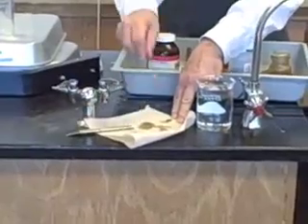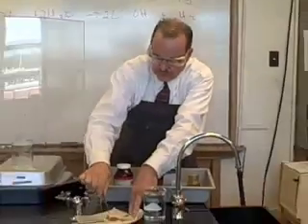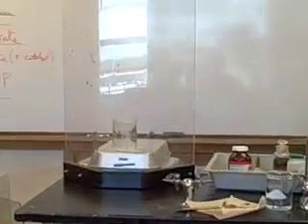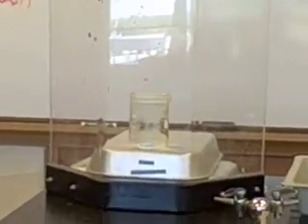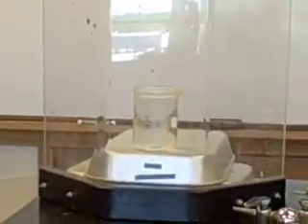The inside of the sodium is shiny like the lithium was. You might want to scoot back just a little bit, just in case.